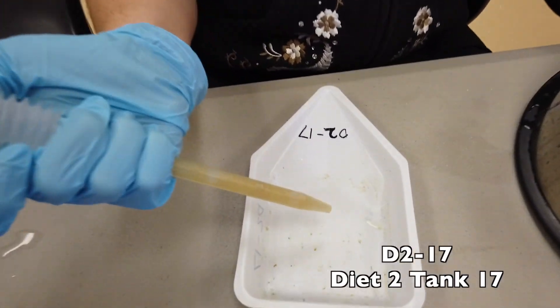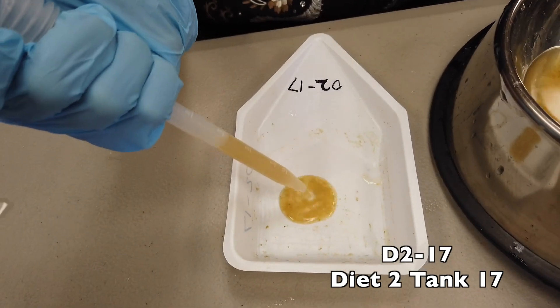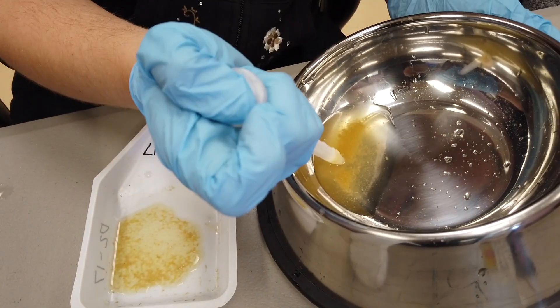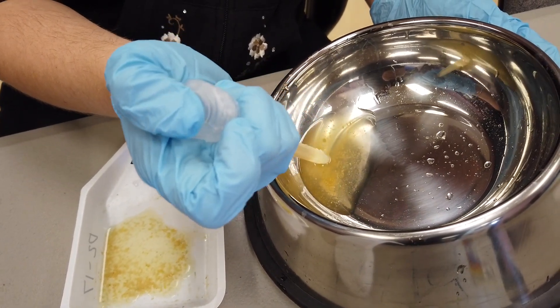The corresponding number goes into the corresponding boat. I just keep going back and forth until I have it all transferred.